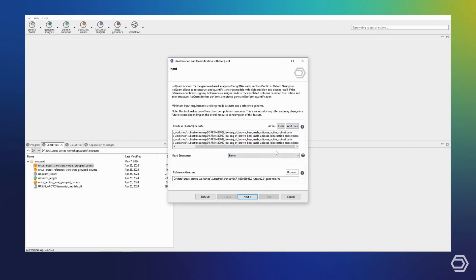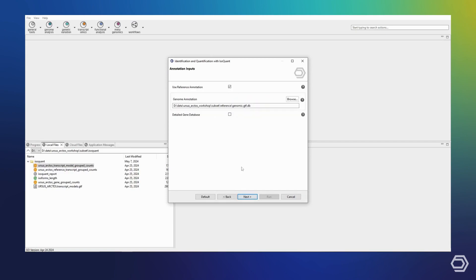IsoQuant in any mode relies on the use of a reference genome, which I have supplied in FASTA format here. On the next page of the wizard, we can decide whether we want to use a reference annotation as guidance or whether we want to use IsoQuant in the reference-free discovery mode. To start off with, I will run IsoQuant in the reference-guided mode and supply a database file here.